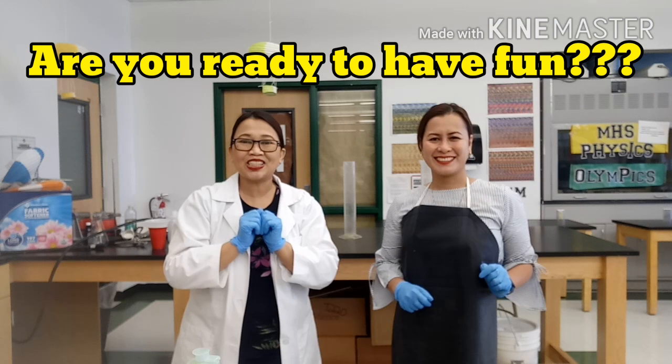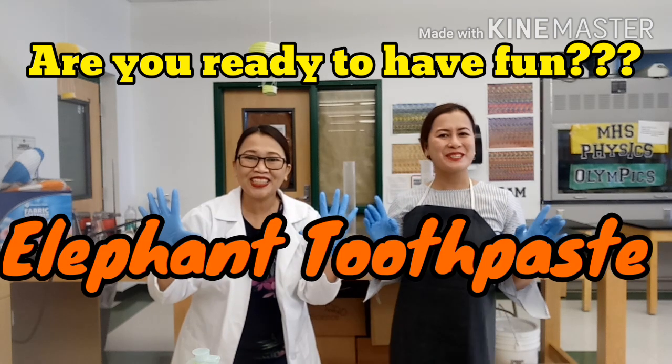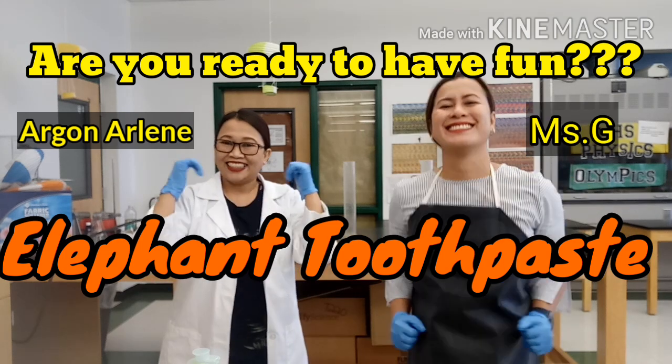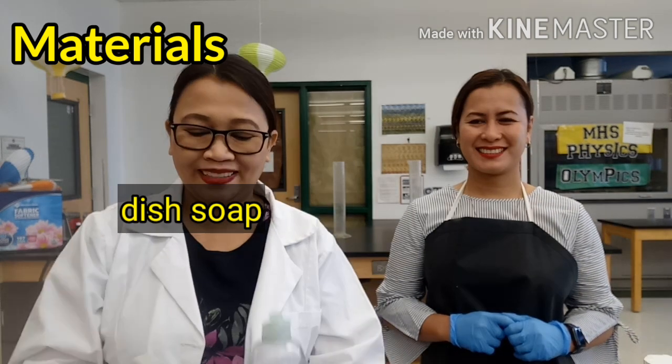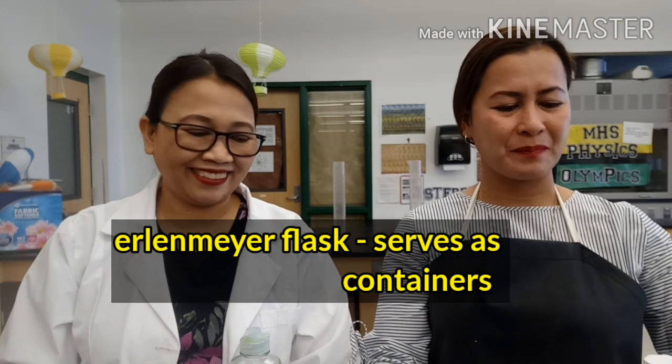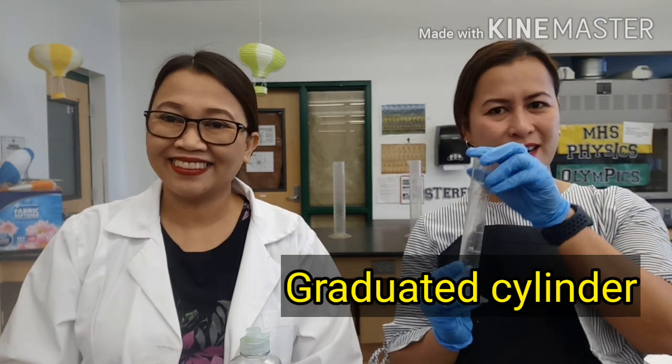Experiment today, and it's called Elephant Toothpaste. I am Arlene. G over here. Let's go! Alright, so for the materials, we'll be using the following: dish soap, food dye, and Miss G, what else? Containers. We will be needing this one. Graduated cylinder for measuring.